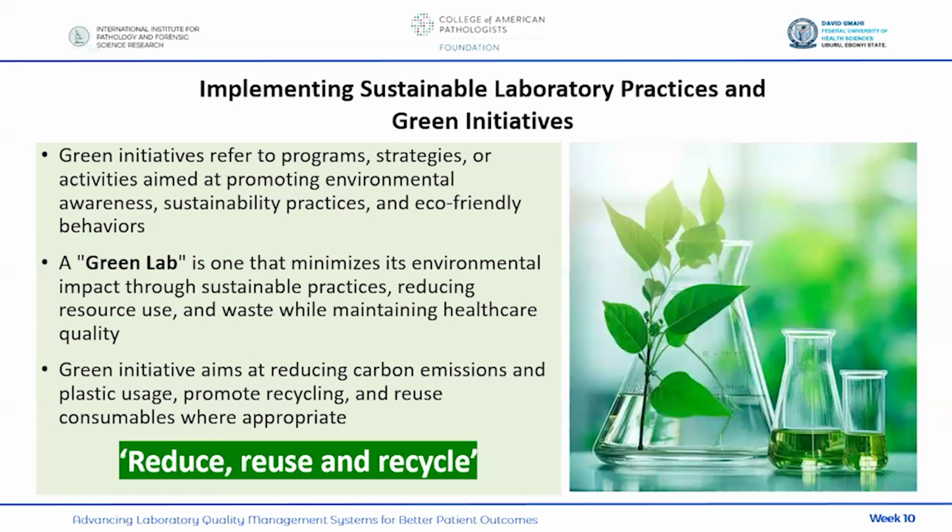A laboratory which minimizes its environmental impact through sustainable practices, reducing resource use and waste, but maintaining quality. You will do all that, but you have to maintain quality. So that is a green lab. So what does it aim at? It aims at reducing carbon emissions. We are all familiar with ozone layer degradation, carbon emissions, and all that. So this is what green initiative aims at: to reduce carbon emissions and plastic usage, to promote recycling of any recyclable material, and reuse consumables where appropriate. So the maxim for green initiative is reduce, reuse, and recycle. That is the maxim for green initiative.